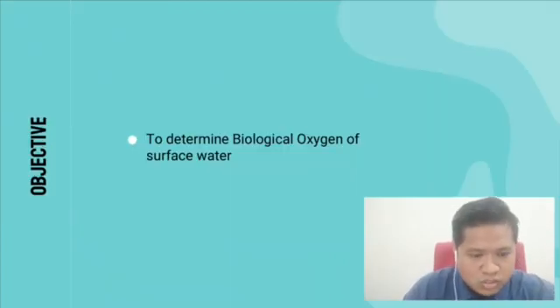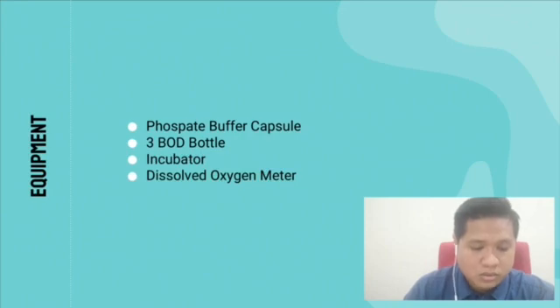Objective: to determine the biochemical oxygen demand of surface water. Equipment: 1, phosphate buffer capsule. 2, BOD bottle. 3, incubator. And 4, dissolved oxygen meter.